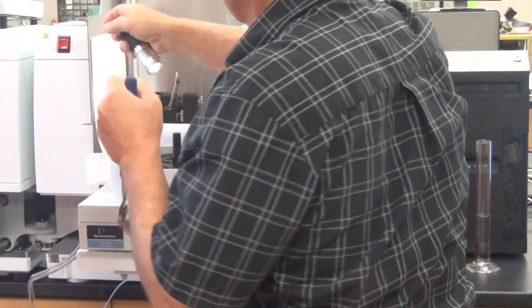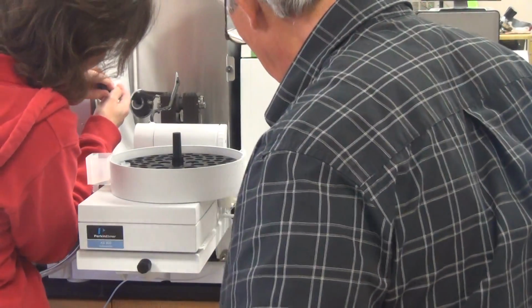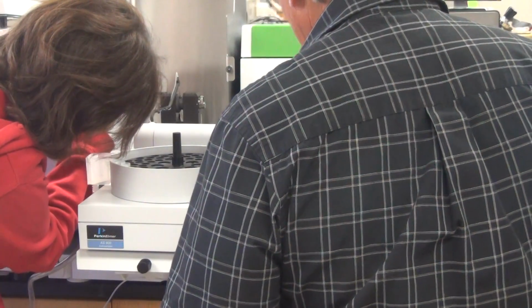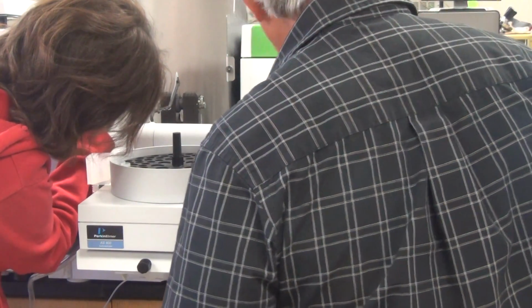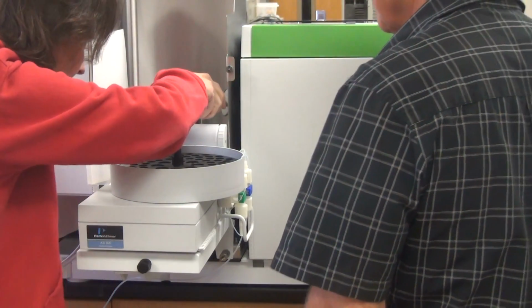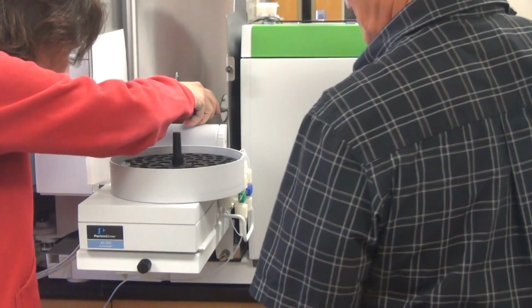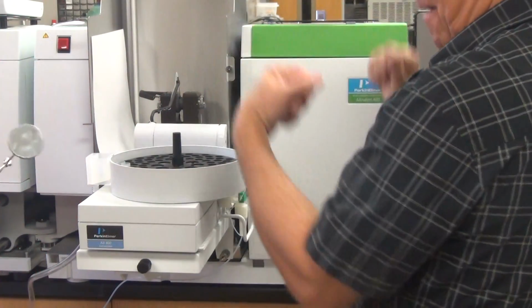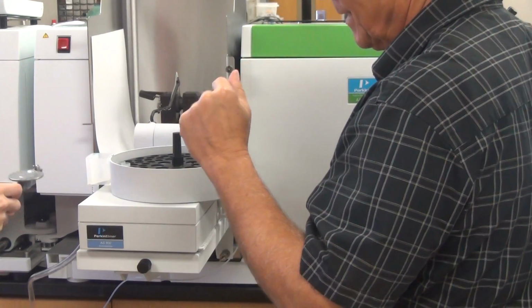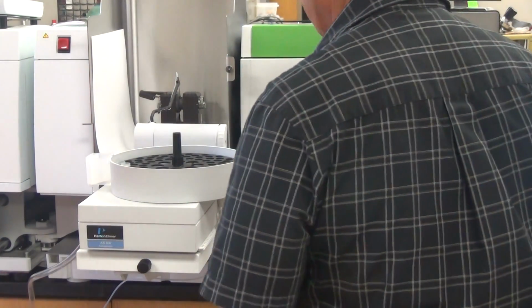Now I want you to look the other direction. Look into the AA lamp. Do you see anything? I can see a lot of red. Yeah, that's about it. You can't even hardly see that tip, can you? No. So that's why you want to come from this side. Now you see it through the white paper. And they modulated that lamp over there too, and that's why they had that. Gotcha. The Pinnacle, the high dollar one, comes with its own mirror, but that's about another $30,000-$40,000.